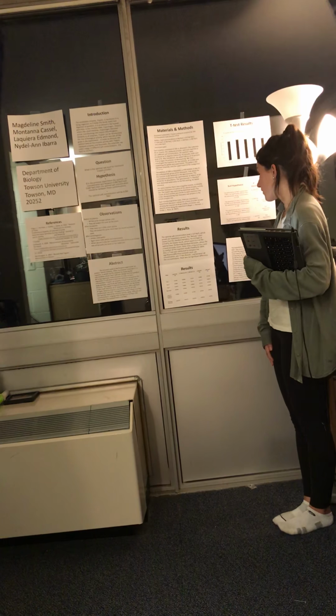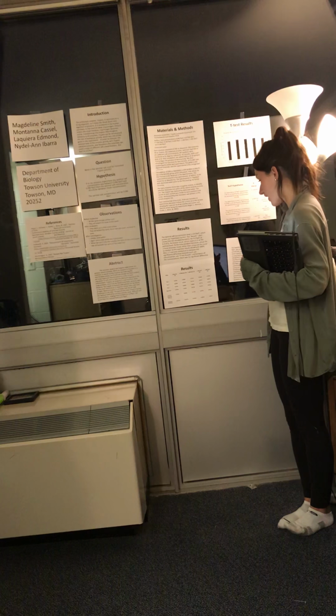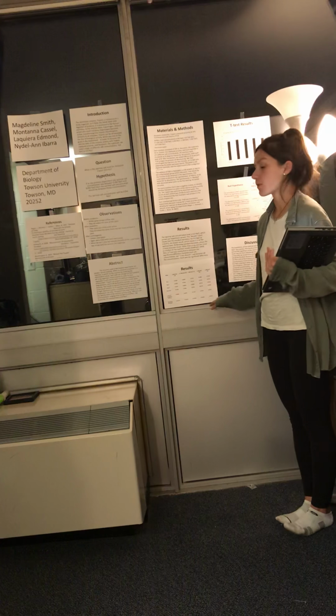And as I said before, the optimal level is 0.0 moles of NaCl, but if we had not done standard deviation, my group would have assumed that it was 0.6 moles of NaCl, because the mean is just as low as 0.0.